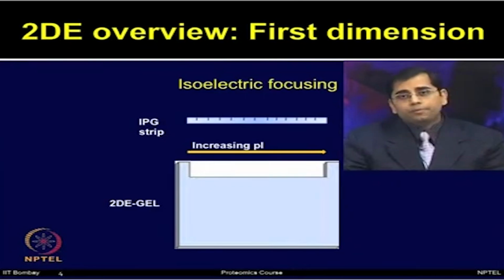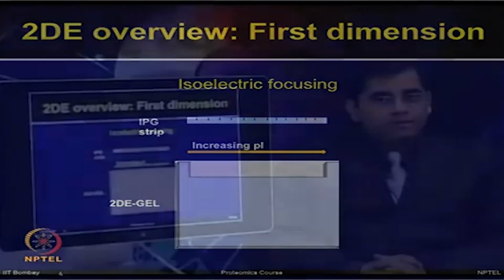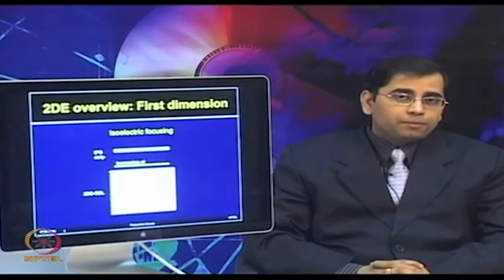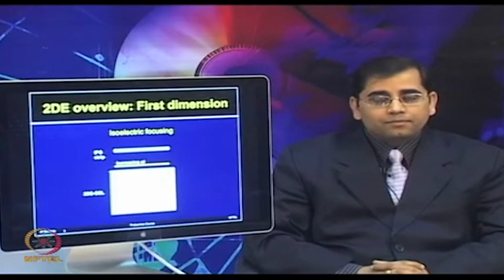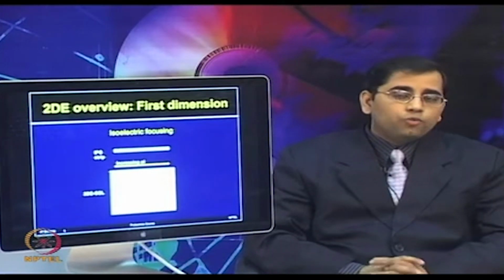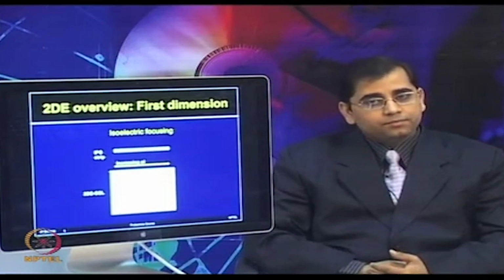Ideally, you want to separate as many proteins as possible. It means you want to get very high coverage of the whole proteome. So, considering the diversity of samples which one can apply on these techniques, it becomes very important that people first standardize very good protein extraction.